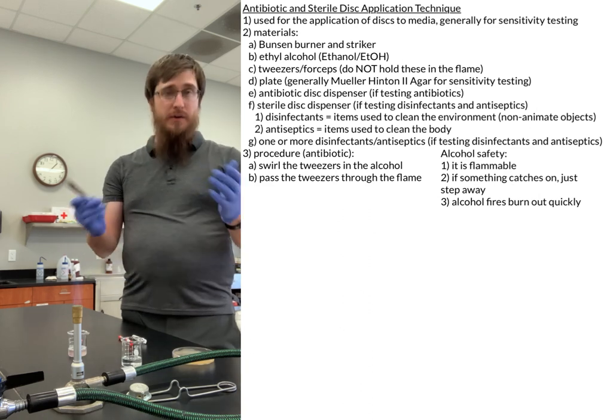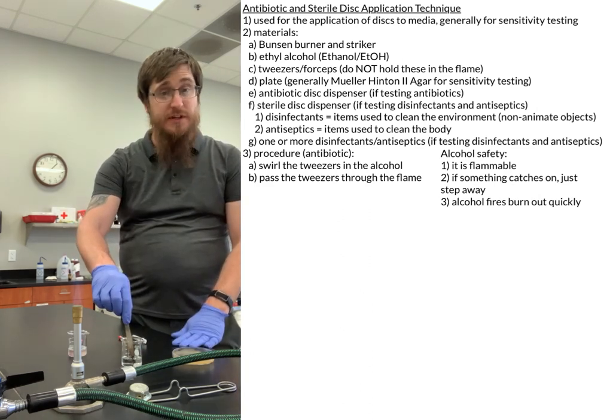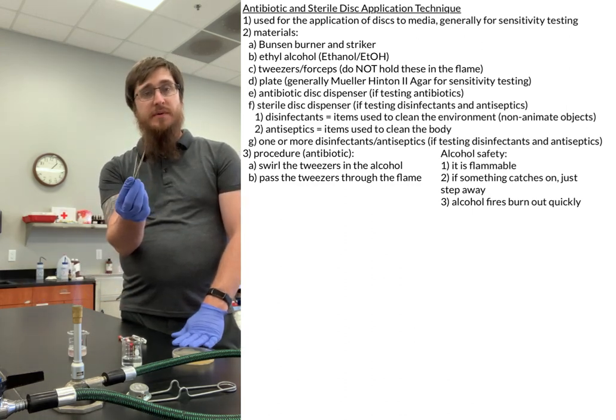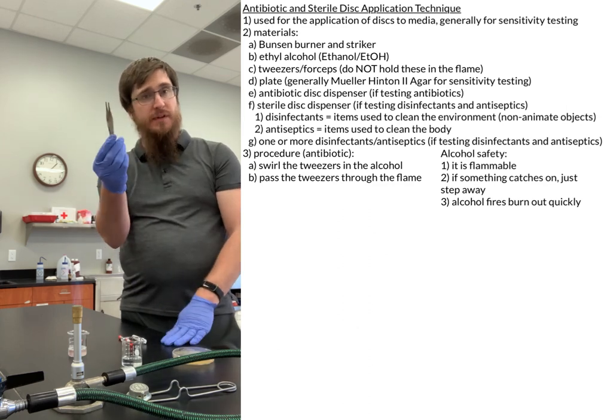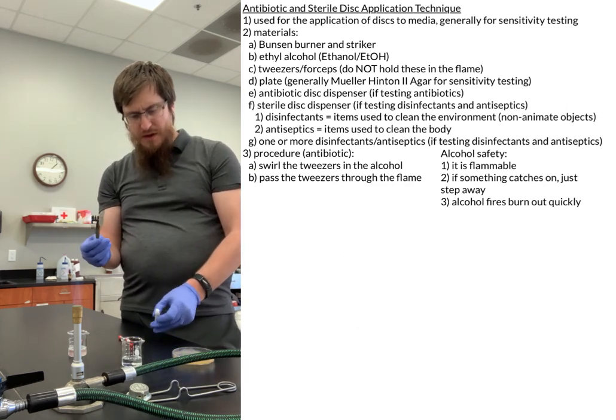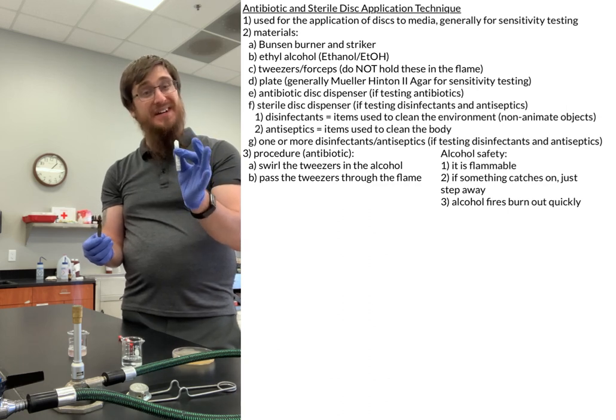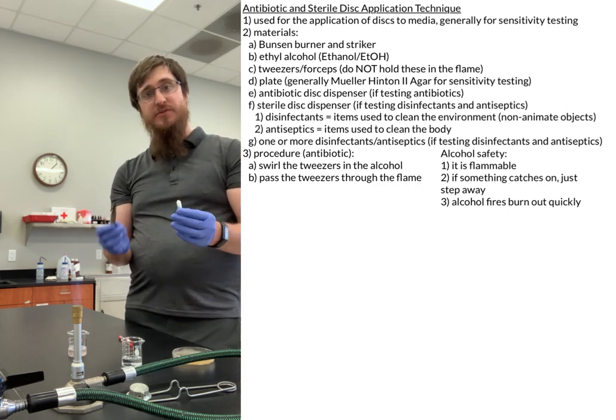All right, I'm going to go ahead and redo my first step again real fast so that it actually is sterile, right? So pass it through the flame, again, dip it in the alcohol, pass it through the flame, now it is sterile. Now the next thing we have to do is get these tiny little discs out, and it can be kind of a pain sometimes to do that.